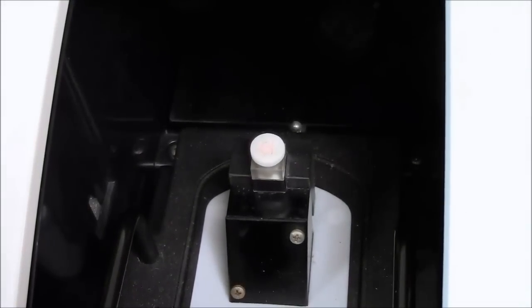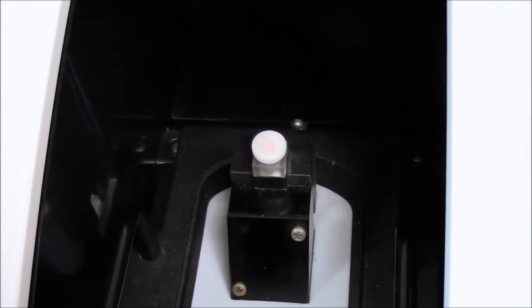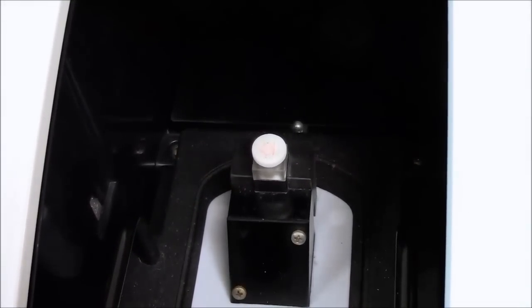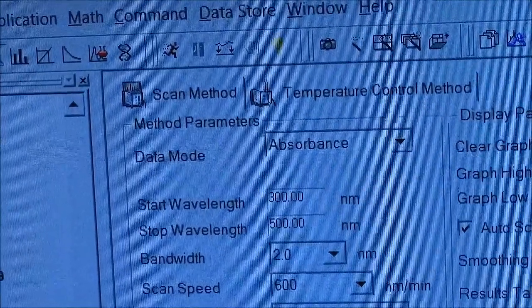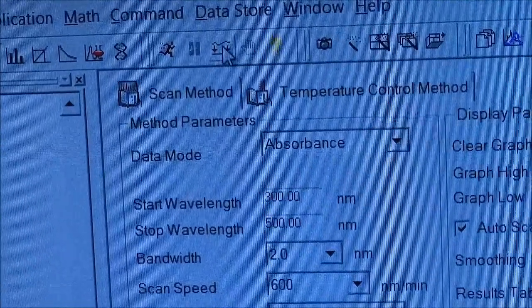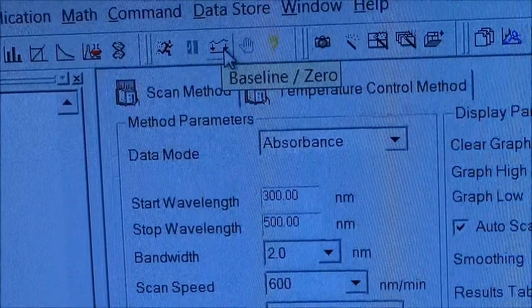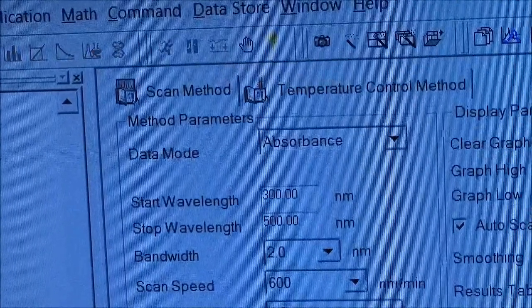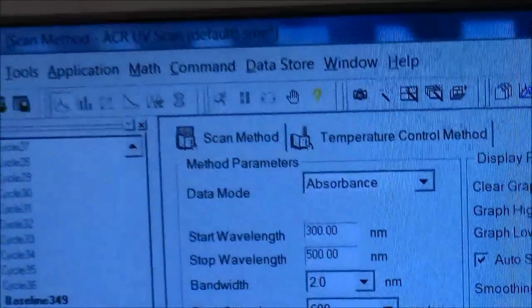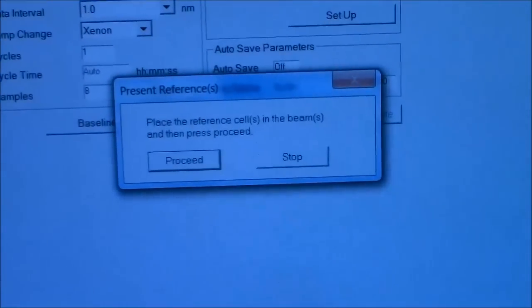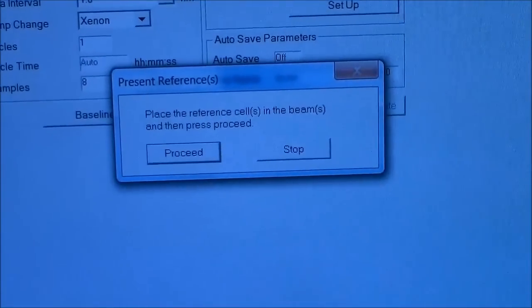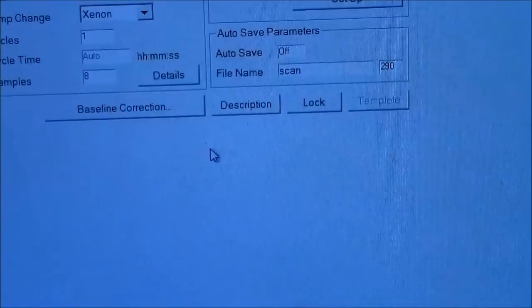All right, so that is ready now to take a baseline. The baseline command is here. It makes the wiggly line flat. It says baseline zero. It now asks me have I got the right thing in the machine. Proceed.